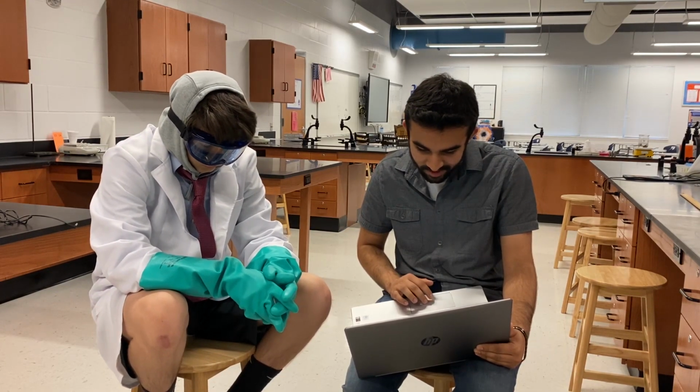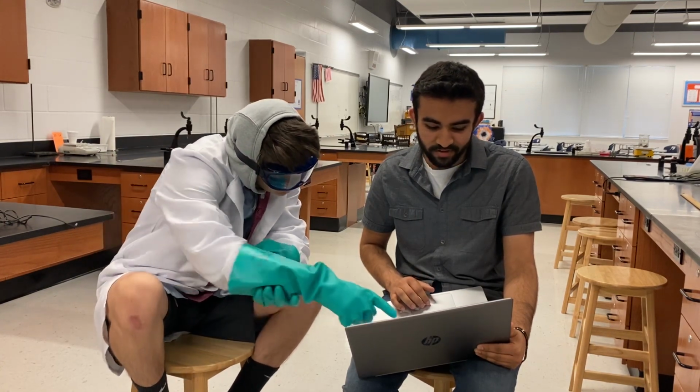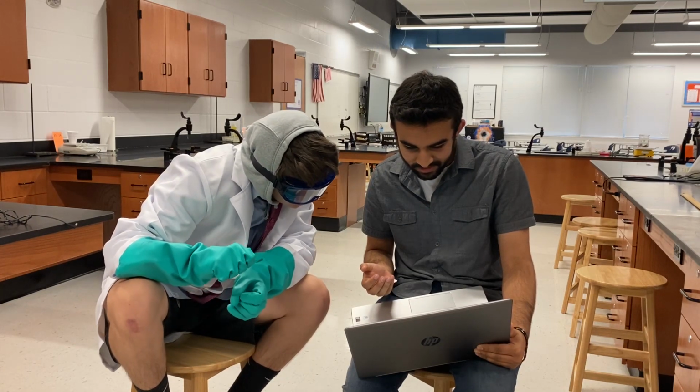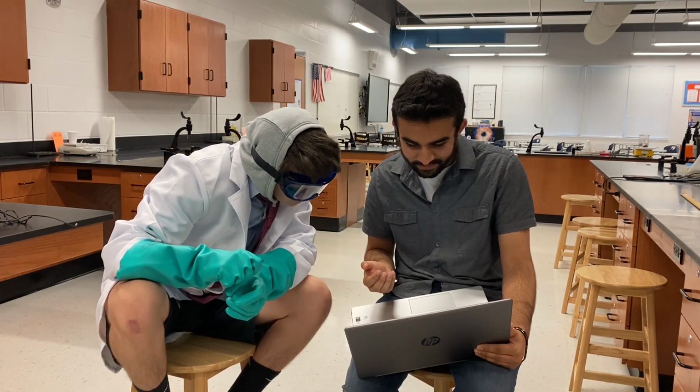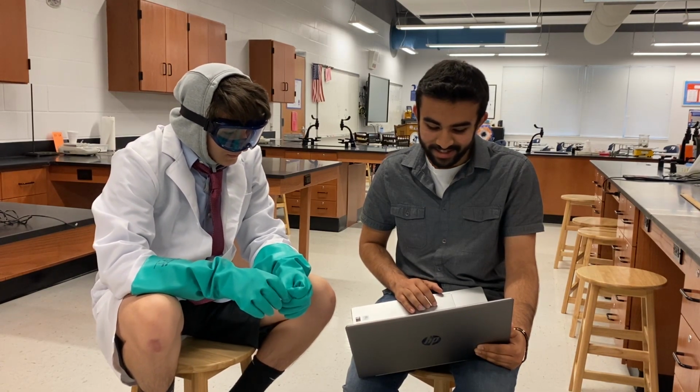Most of this is about just being extremely careful when it comes to acids and glassware. What is 52? 52 is pretty nice. Be sure to use all sharp objects for their intended purpose. Obviously you don't want to play around and actually cut yourself, because that would be awful.